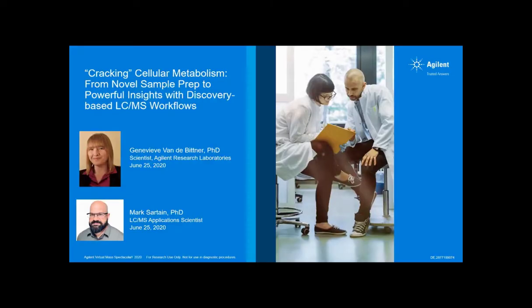Welcome and good morning. This morning's webinar will cover a new comprehensive workflow for cracking cellular metabolism, from sample prep to data collection and analysis. The first portion of the talk will introduce a new mammalian cell sample prep workflow that uses a room temperature metabolism quenching solution and solid phase extraction to provide metabolite and lipid fractions from individual cell samples.